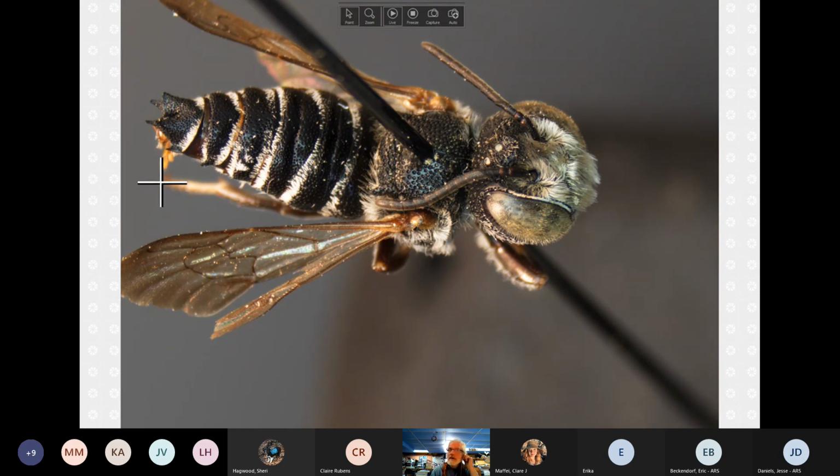Another area that we'll be looking at and concentrating on is these grooves. So here's T1, T2, T3, both have grooves, which you can see by they're in the shadow right here, but we're going to look at whether these grooves are continuous across the segments or they disappear in the middle. Usually they're always present on the far lateral sides, but the question usually is whether they're present in T2 or T3 across the middle.